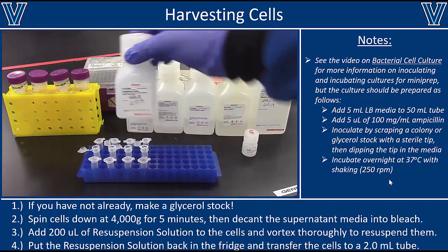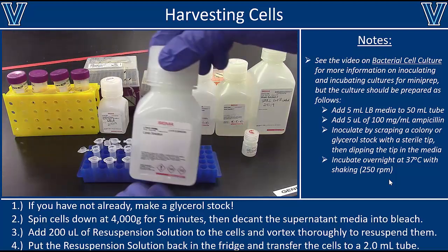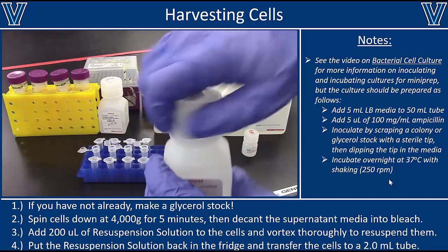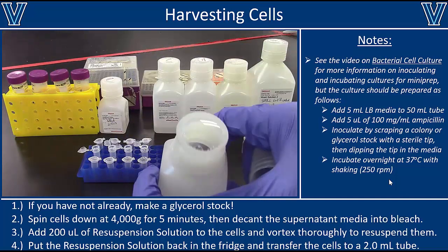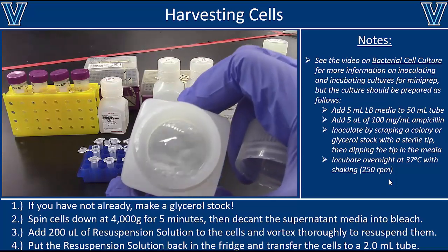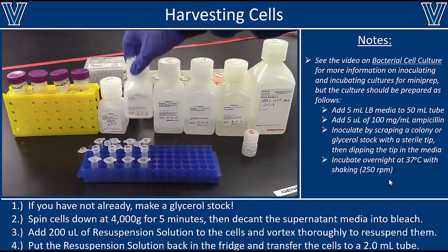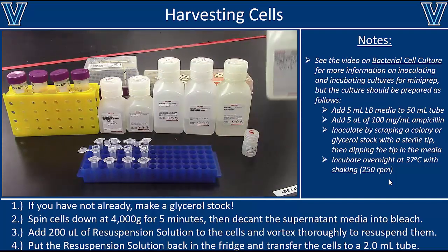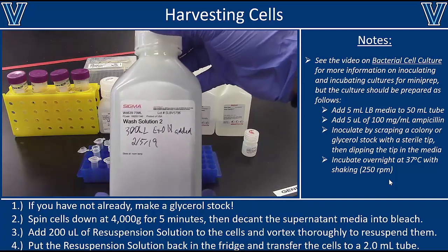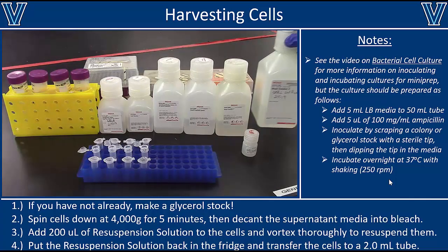The resuspension solution that we'll use is stored in the refrigerator, so you want to grab that. The lysis solution, you want to check each time you're doing a mini prep to see if there's any precipitates in there. So there's SDS in the solution that might precipitate, and if it precipitates, then we don't get cell lysis. But if you do see precipitates, just heat the solution up to around 50 degrees Celsius. They should resuspend. Then last but not least, there's that wash solution too.